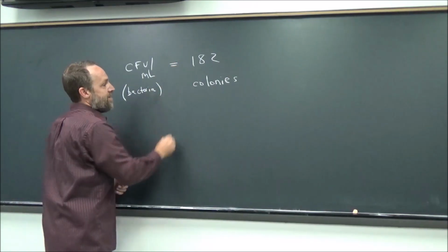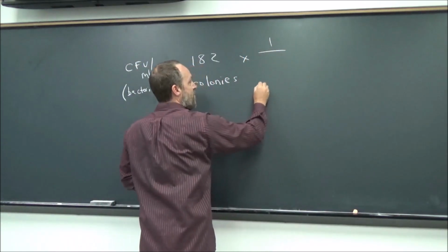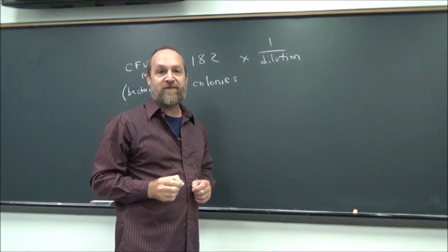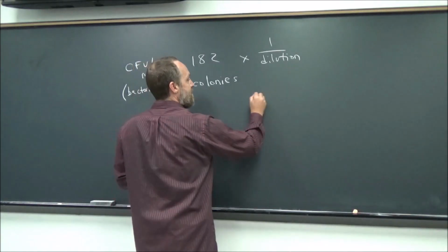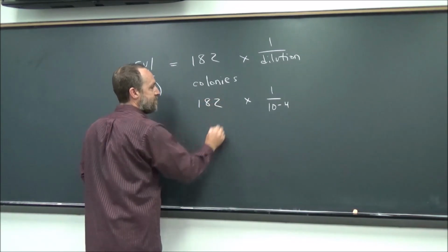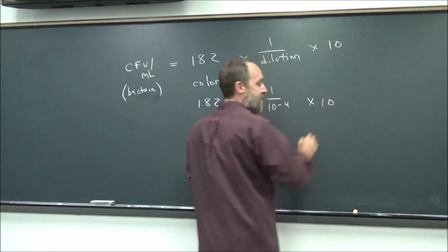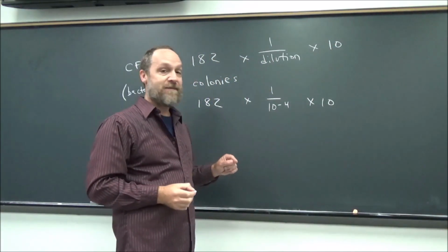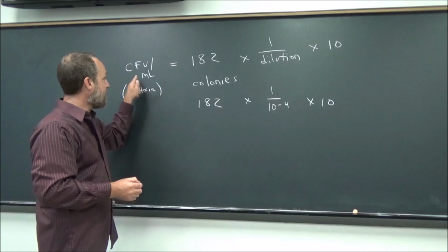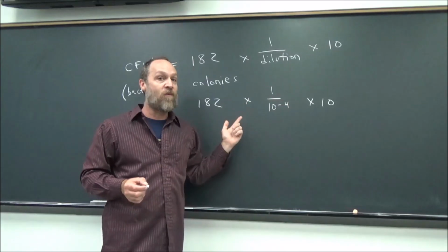Okay, so we take the number of colonies, 182, times 1 over the dilution. Now, the dilution of petri plate number 4 was 10 to the minus 4. So that is 1 over 10 to the minus 4. All right, and then we multiply it by 10. Now, the reason we multiply it by 10 is because we sampled 0.1 milliliters of the original sample. We want to know how many for 1 milliliter, so we have to multiply 0.1 times 10 to get 1.